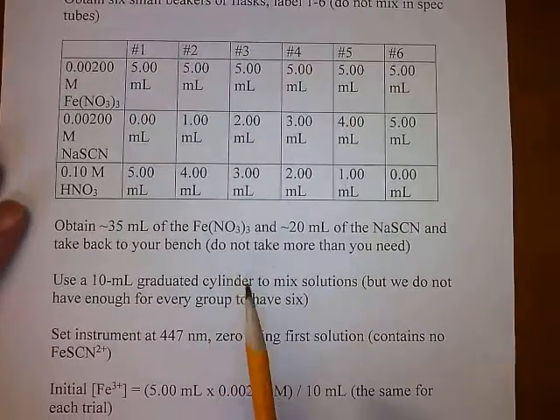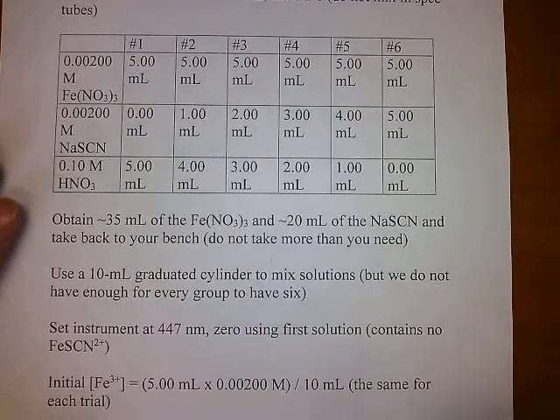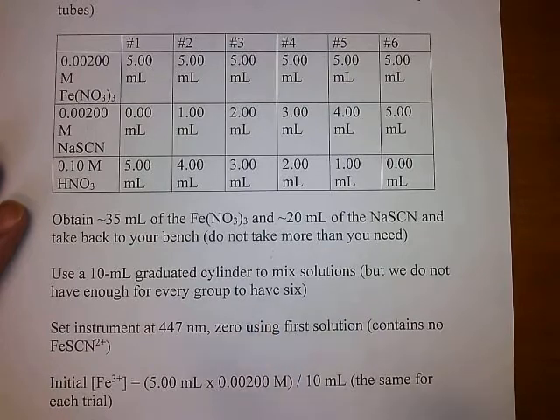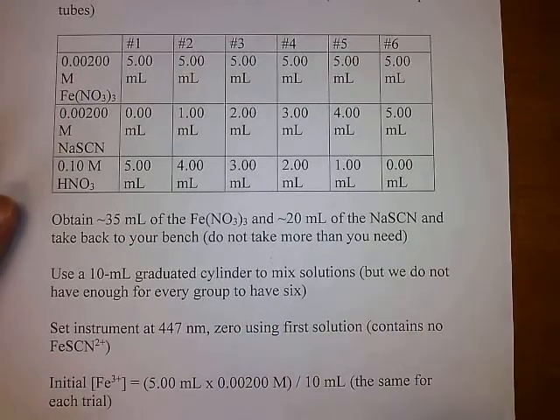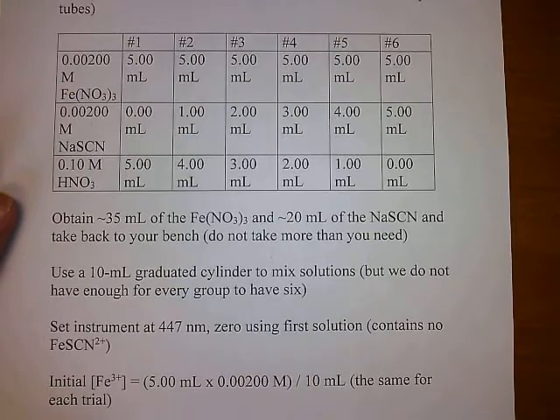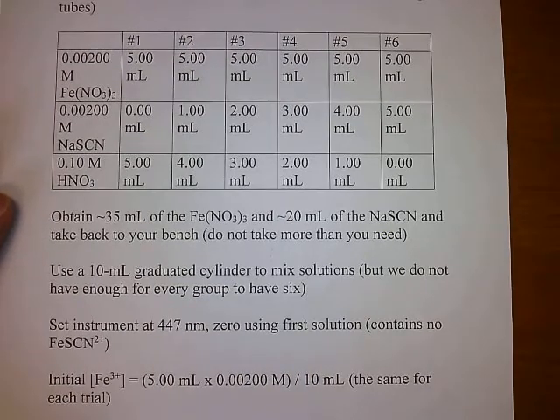You're going to use a 10 mil grad cylinder to mix the solutions, but we don't have enough grad cylinders for every group to have 6, so you'll have to use the same one. Just be sure you wash it out each time after you mix the solution.